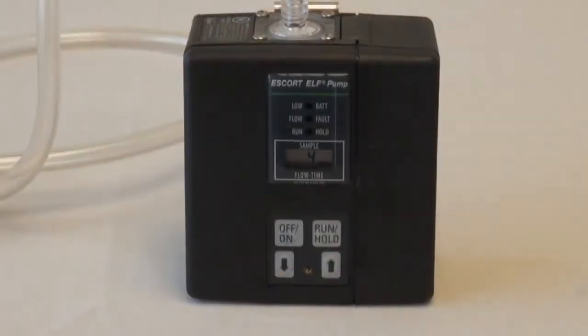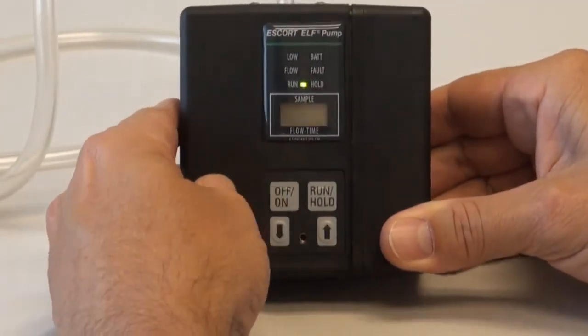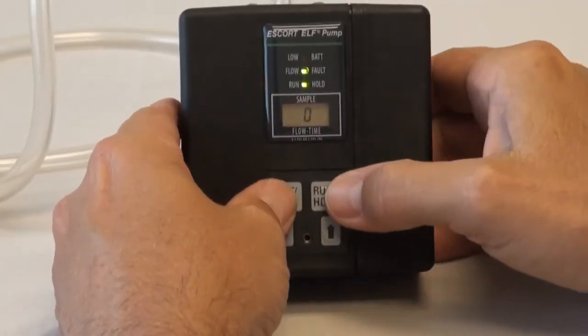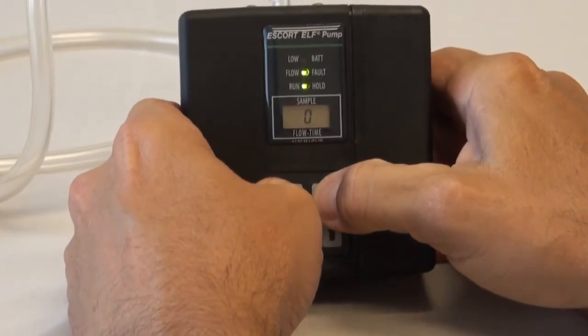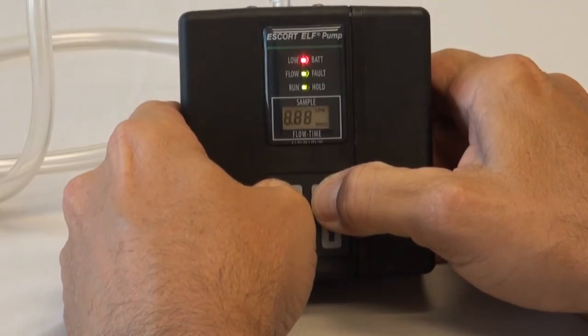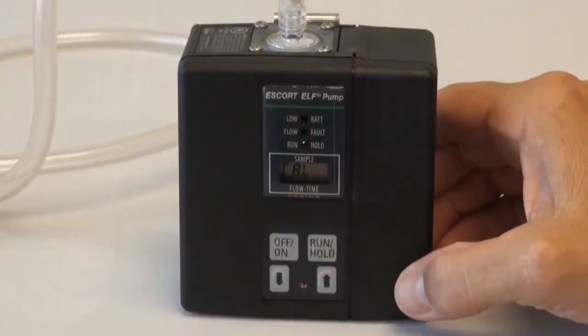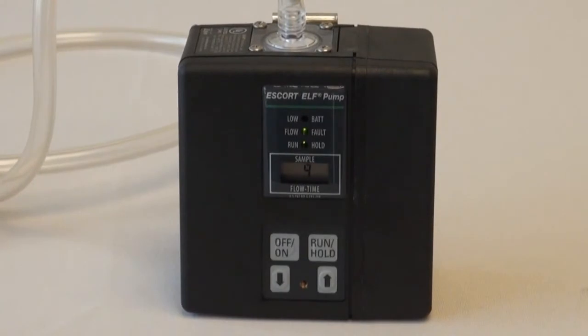Turn the pump on. As the pump goes through its self-check sequence and the LED lights illuminate, press and hold the ON-OFF and the RUN-HOLD button simultaneously until the display reads CAL. Immediately release both buttons. Failure to release both buttons will turn the pump off. The LCD display will now show CAL and a countdown sequence will begin from the number 9 to 0.